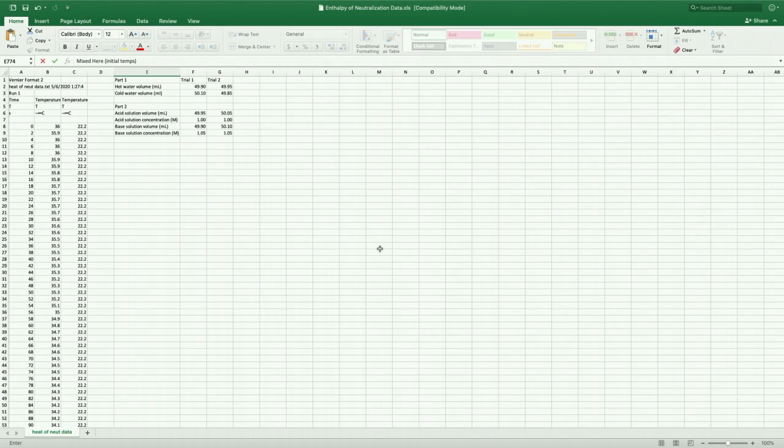In terms of safety, you probably do want to be careful with 6 molar HCl. That's concentrated enough acid before we diluted it that you want to be careful with it. It will burn your skin. I think I made mentions of that before. And so take caution with your acids and bases. Anytime you have an acid and base solution, you want to take caution.